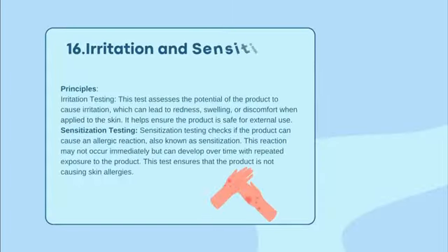16. Irritation and sensitization. Testing principles, irritation testing: this test assesses the potential of the product to cause irritation, which can lead to redness, swelling, or discomfort when applied to the skin. It helps ensure the product is safe for external use.